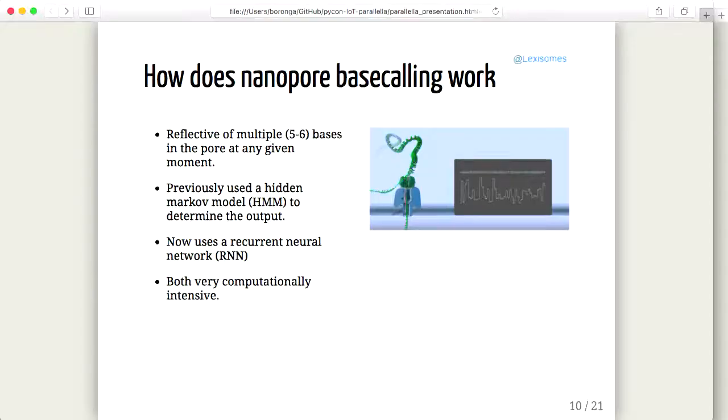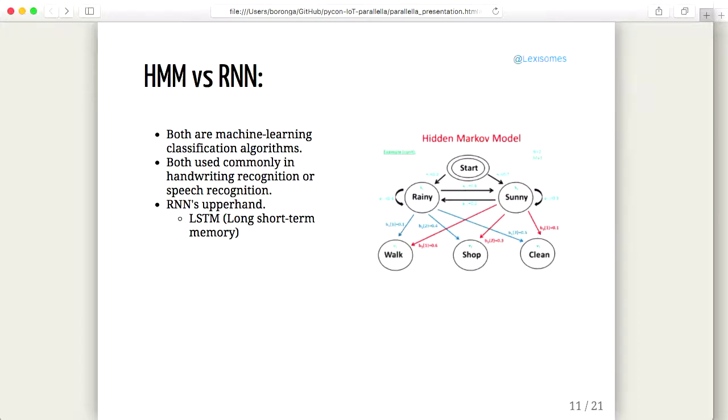I'm not explaining that quite well, but what I'm trying to point out is that this spike here that's corresponding to a G may also be related to something that's 10 or 12 bases back. But if our k-mer-based model is only on 5 or 6, then we're not going to be able to pick that up. So this is where the LSTM comes in quite handy.